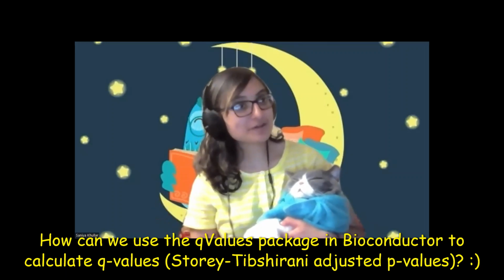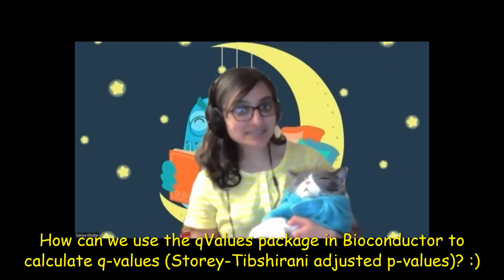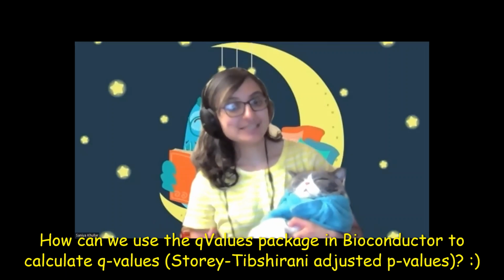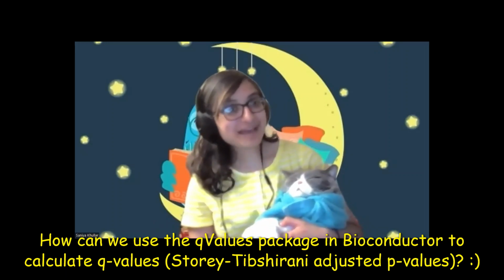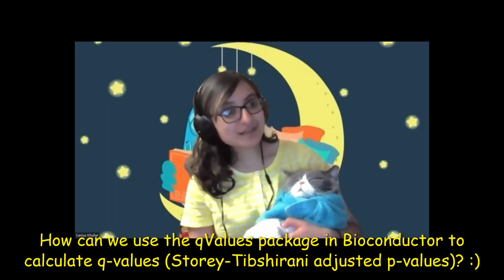So q-values are p-values from different experiments that are adjusted, and they are adjusted using the Storey-Tibshirani method. So how to use q-values, and in particular, how can we use the qvalue package in Bioconductor? That's what we will be talking about in this video.